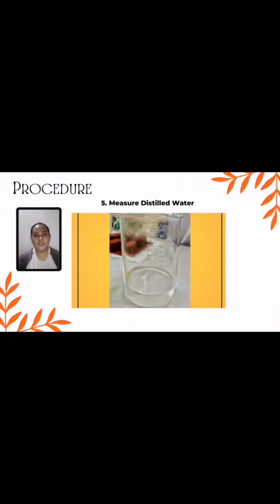After combining the oils, the next step is we measure 171 milliliters of distilled water using the graduated cylinder or the beaker.